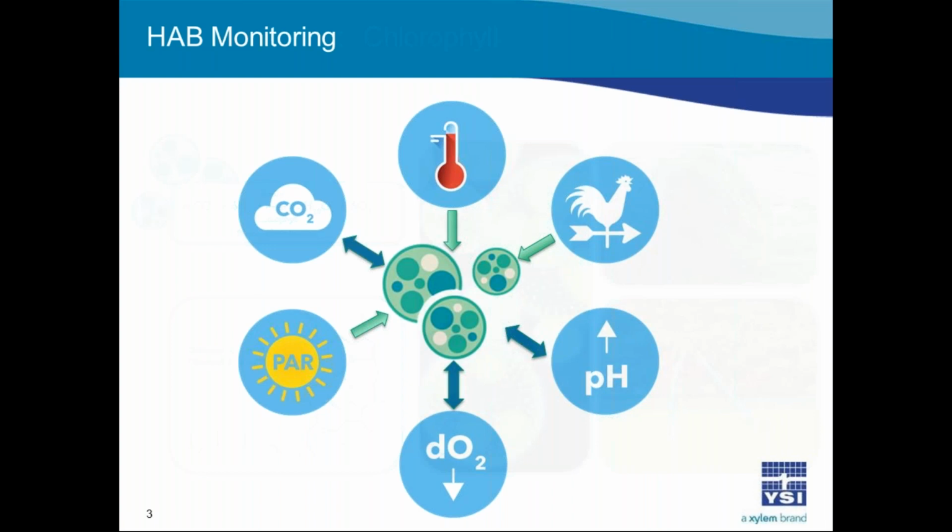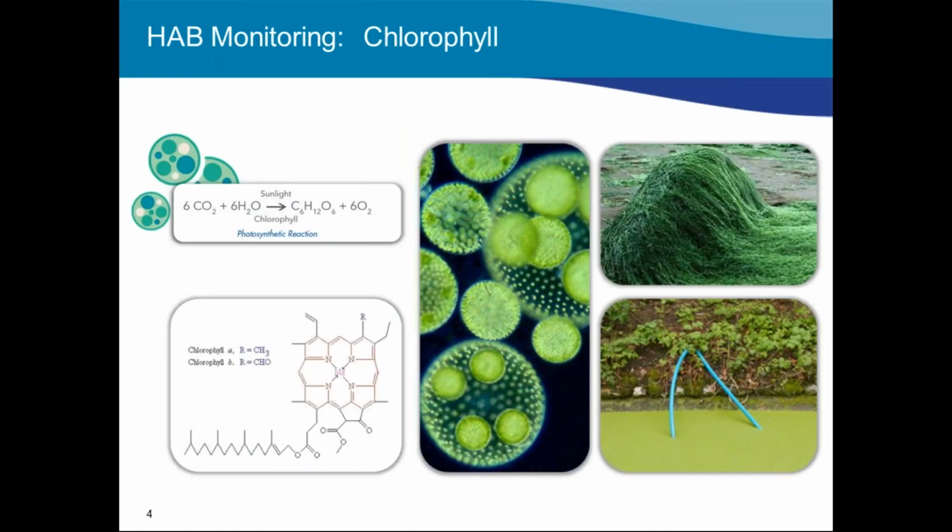And of course, one of those parameters that people monitor most often when they're interested in algae blooms is chlorophyll. Now, in my first webinar, I talked about both chlorophyll and phycocyanin.